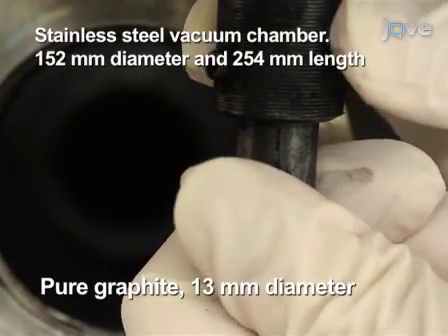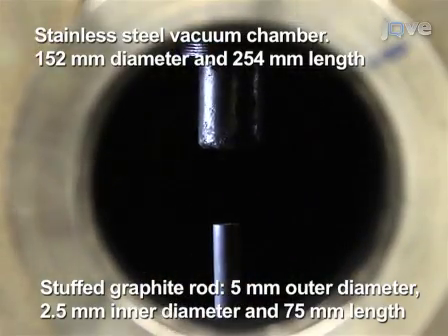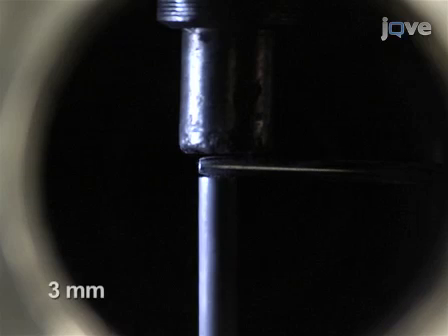Install a cathode rod and the stuffed anode rod inside the cylindrical chamber. Adjust the gap distance between the cathode and anode to about 3 mm.